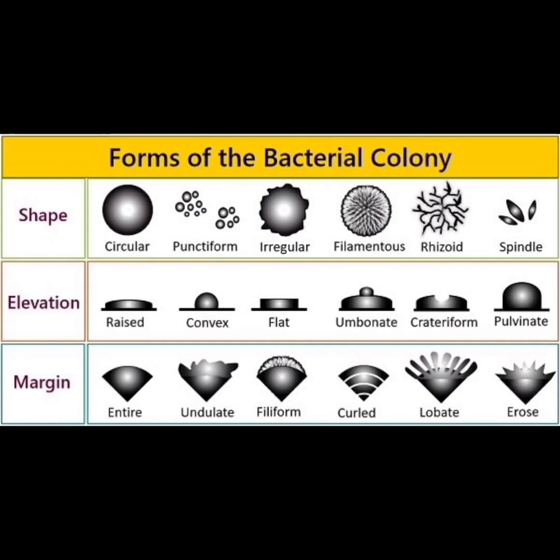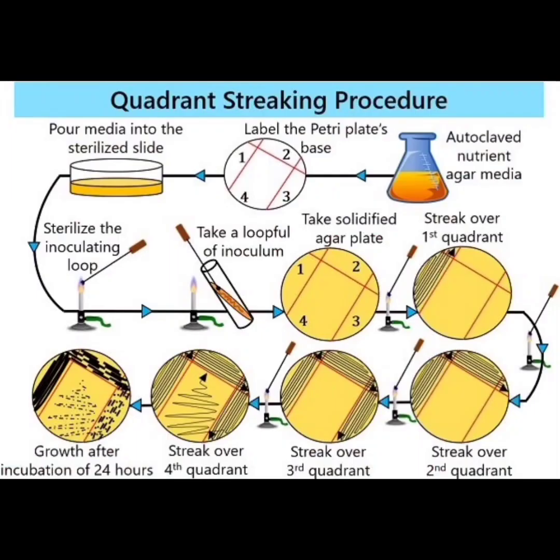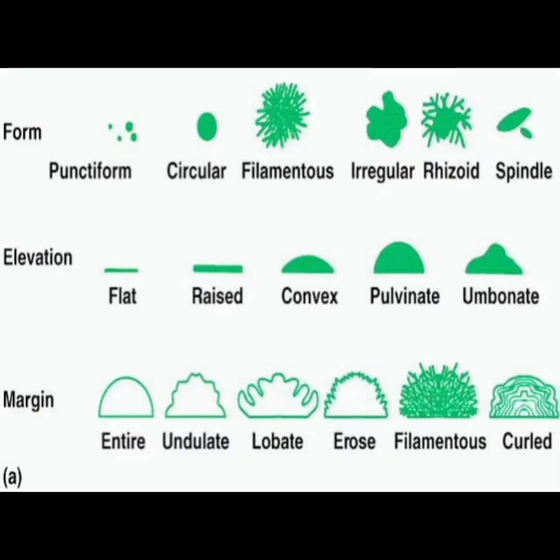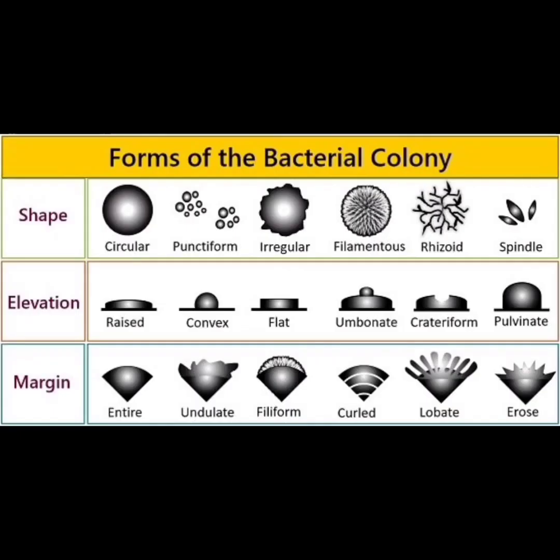Colony characteristics may be viewed with the naked eye and with the assistance of a colony counter. Colony counter, I think, is the figure I showed you in the last class. Basic categories of growth characteristics include colony shape, margin, edge, elevation, color and texture.